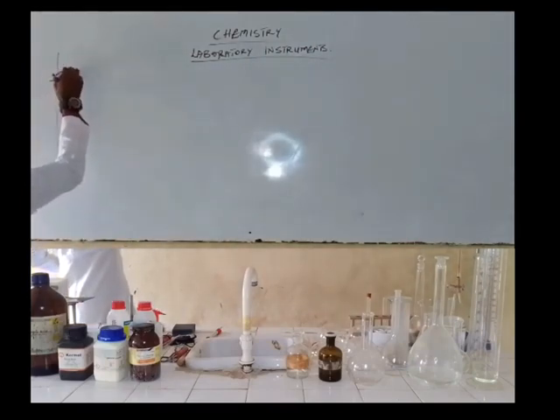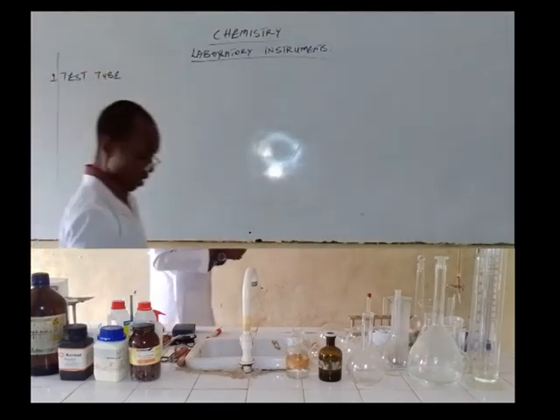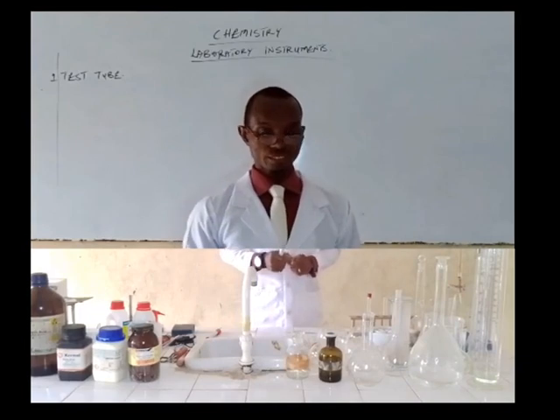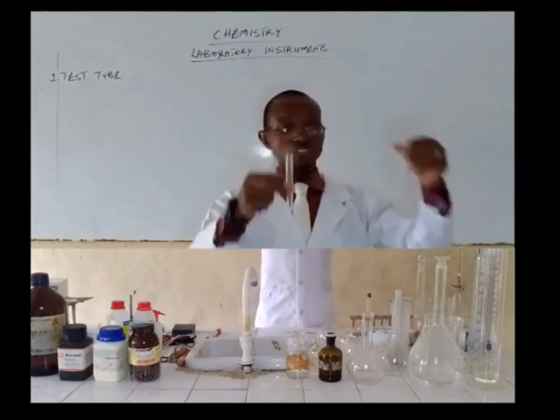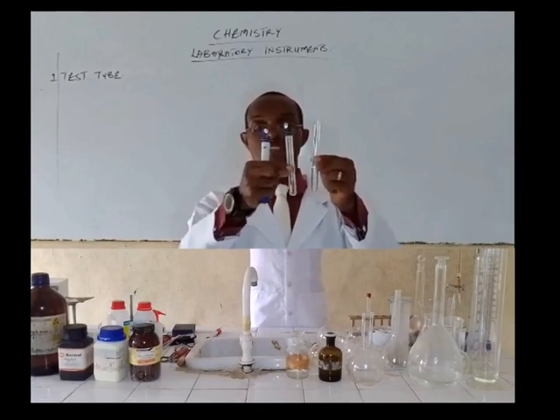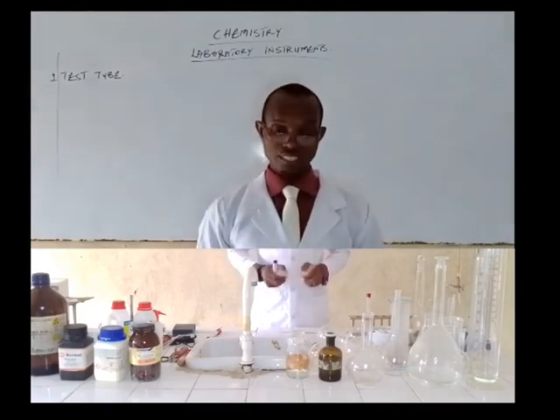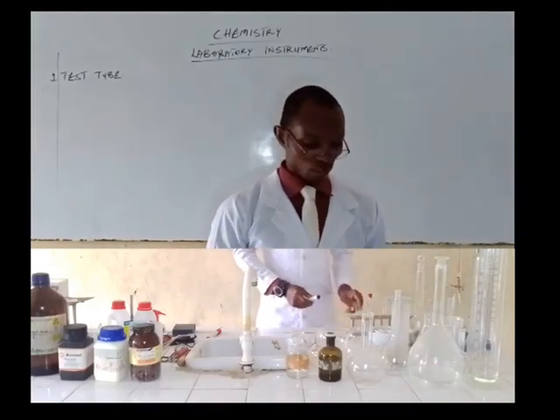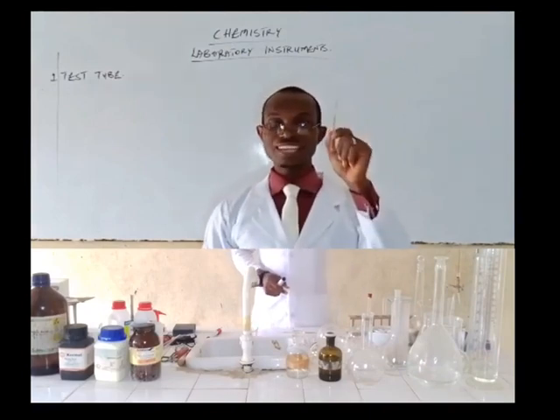The first laboratory instrument we are talking about is the test tube. It is a glassware, and it comes in different sizes depending on the kind of practical you are carrying out. As you can see, these are two different test tubes but they are not of the same size — this one is longer in length compared to the other. So we have varying sizes of the test tube.